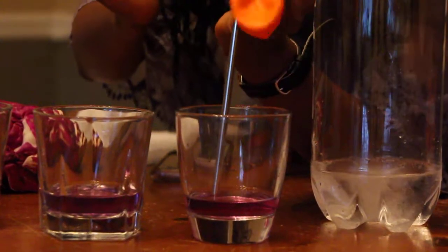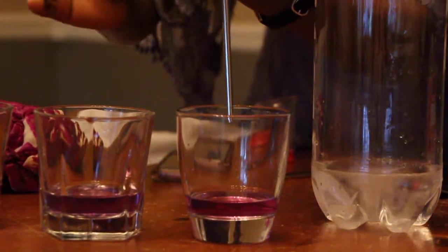All right. Let's see if we got a change, if we have any difference. Well, we can compare it to the water that's in this one.